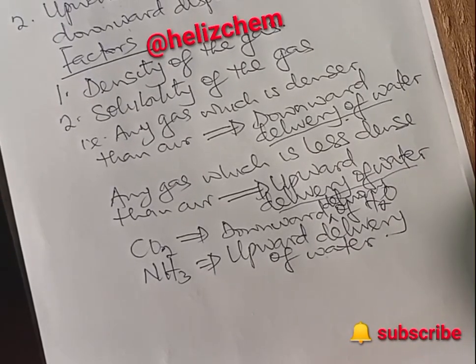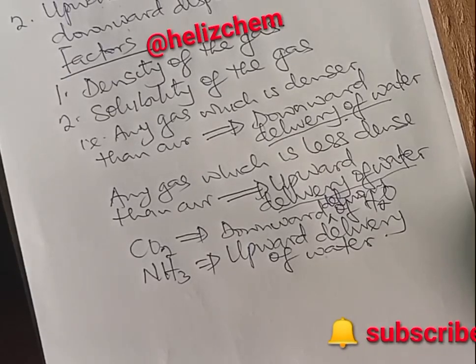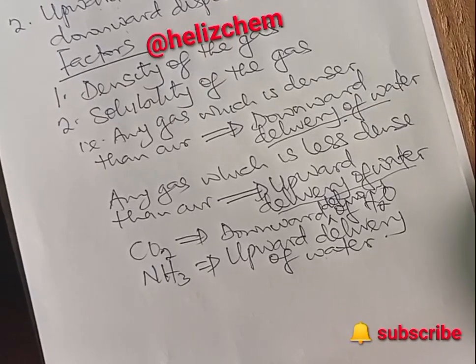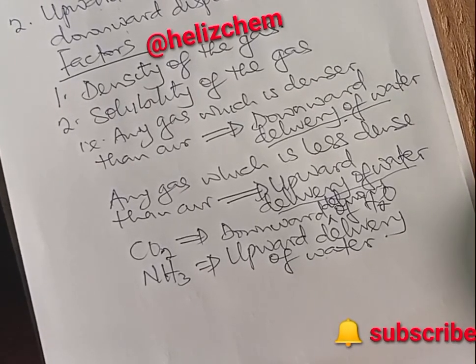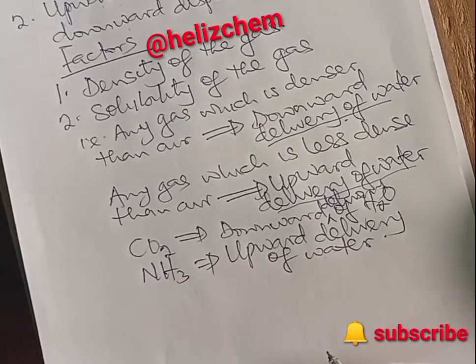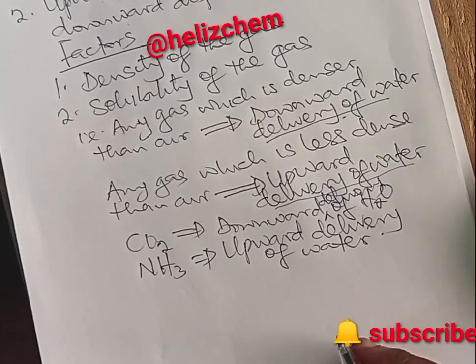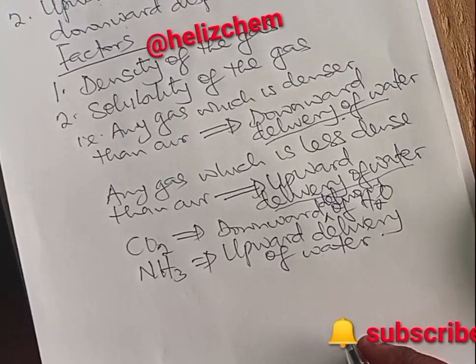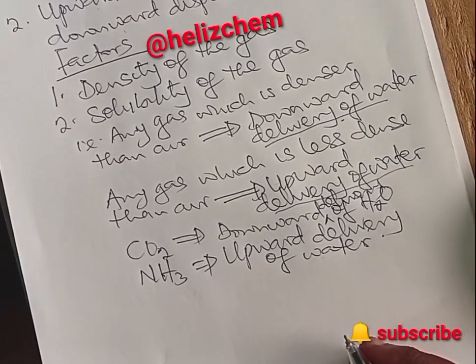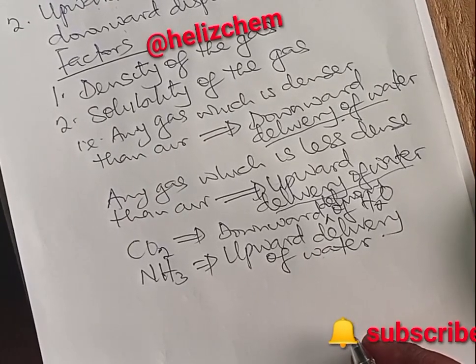Then the question that I want to ask you is, how will you know which of the gases is less dense or which one is denser. You don't need to cram anything. Just stay tuned on this same channel, Helizchem, as I will be bringing you how to know gases that are less dense or denser than air, so that you'll be able to know which of the two methods will be used to collect such a gas.